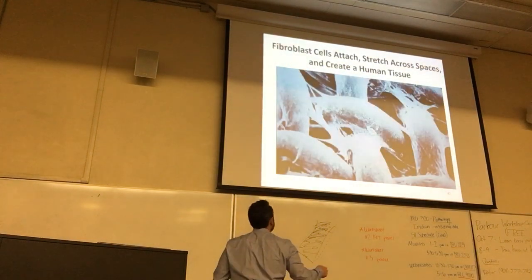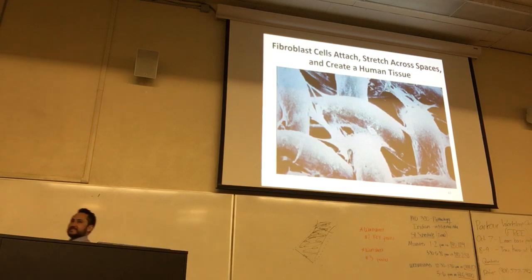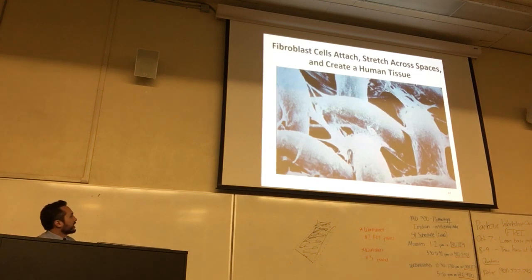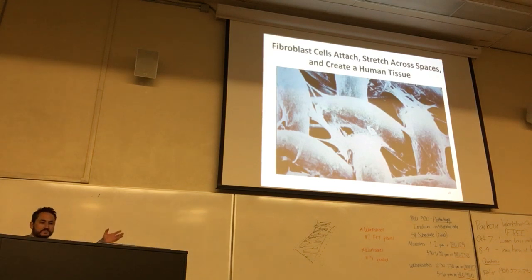That human tissue looks something like this. This is like a classic picture from like 1989, okay? Michael Jackson was probably playing in the background when we were taking this picture. And this is the polylactic acid fibers, and this is a fibroblast, a dermal fibroblast, a skin fibroblast. See how, remember I was telling you how they grow and they grab on? See how it's grabbing on and attaching? Here's a neighboring fibroblast that's off the screen, and here's its attachment. So they literally grow and grab onto the scaffold architecture, and this is a synthetically derived scaffold.